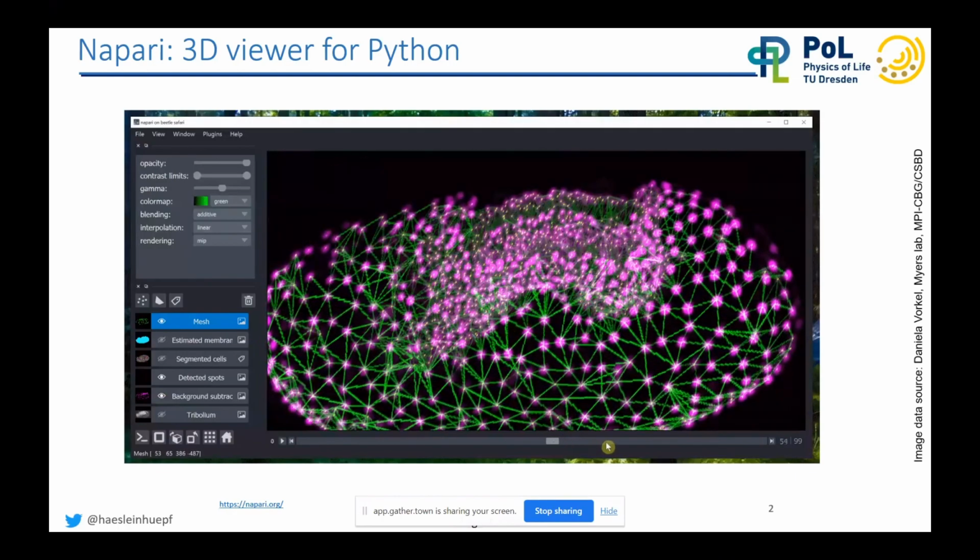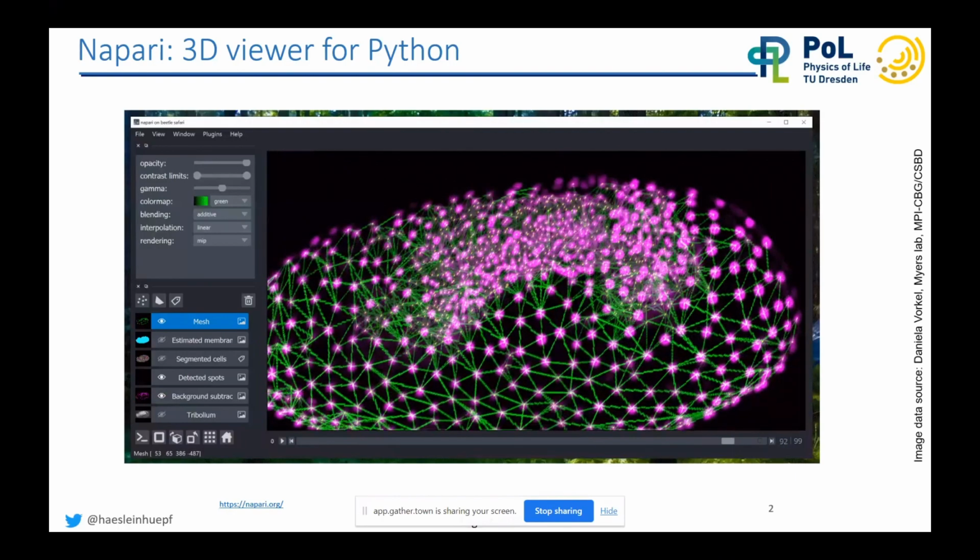This is stuff I always wanted to have, like when I was working with ImageJ before as well. And this 3D interaction was really something that was not available at all in the ImageJ ecosystem. You have plenty of windows on your screen, and it was kind of confusing if you had more than 5. And Napari with these layers here on the left brings order into this and allows to interact with 3D data. And now that microscopy is, at least in my local environment, mostly 3-dimensional, I'm very happy that we have this kind of viewer available for interacting with data in 3D.